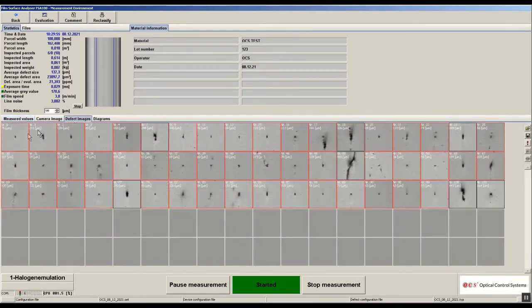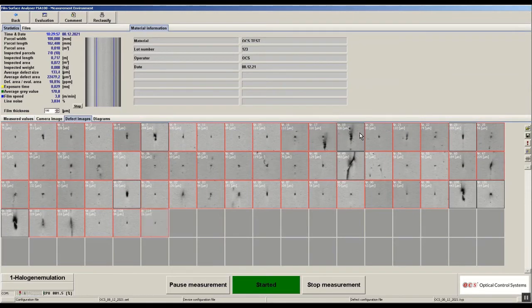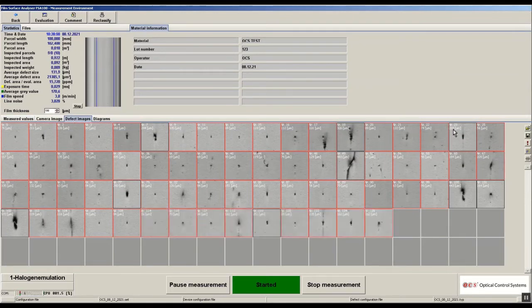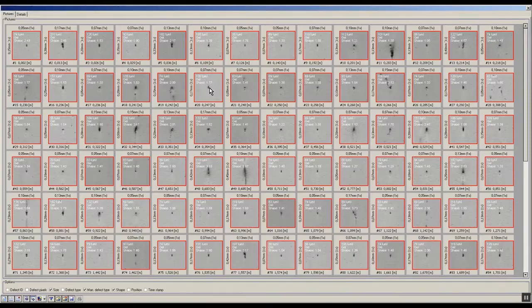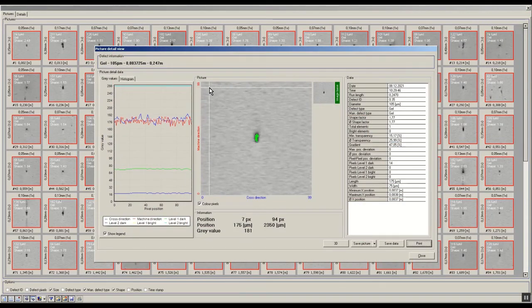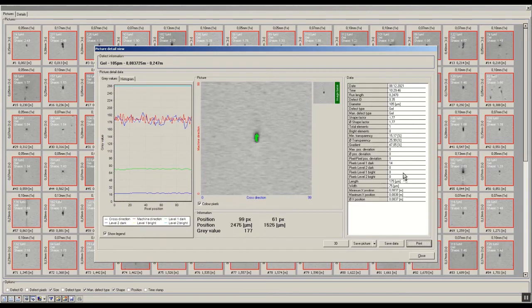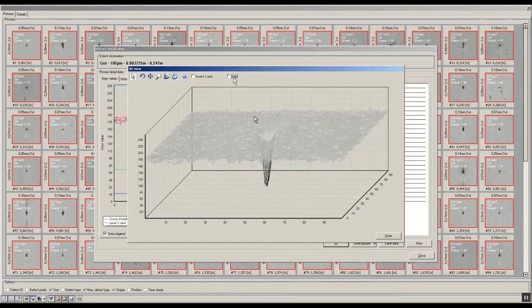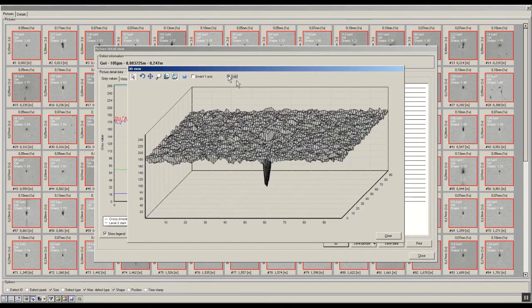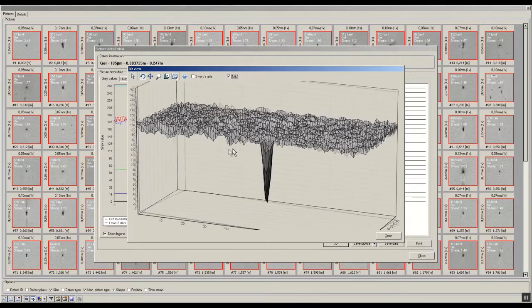Each mosaic picture will be shown during the measurement and will also be stored on the hard disk. With a simple click on the defect, additional information like the size of the defect, the defect type, the width and the length will be shown. An additional feature is the 3D view of the mosaic picture.